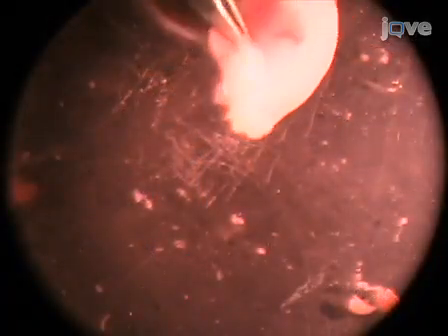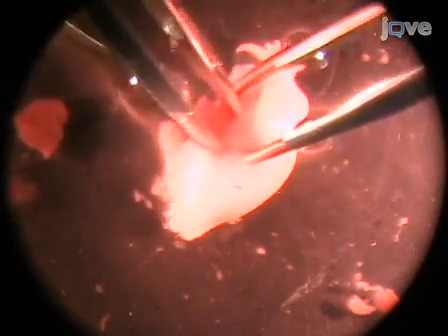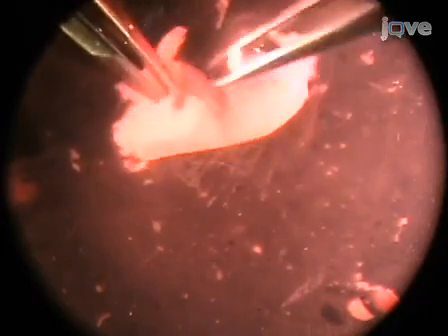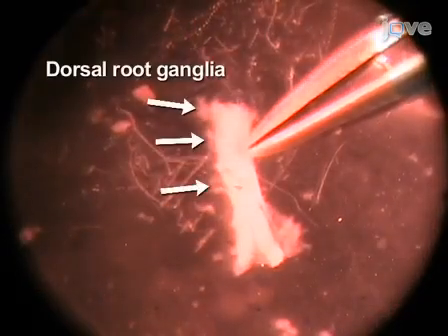After decapitating the embryos, place an embryo on its side. While protecting the spinal cord with one set of forceps, use the other set to strip away the limbs and abdominal organs. Next, turn the embryo and hold it steady with one set of forceps. Snip along the length of the embryo from the neck to the tail until the entire spinal cord is exposed. Grasp the end of the spinal cord carefully, then pull it over itself towards the tail to remove it. The cord will pull free with membrane and dorsal root ganglia attached.